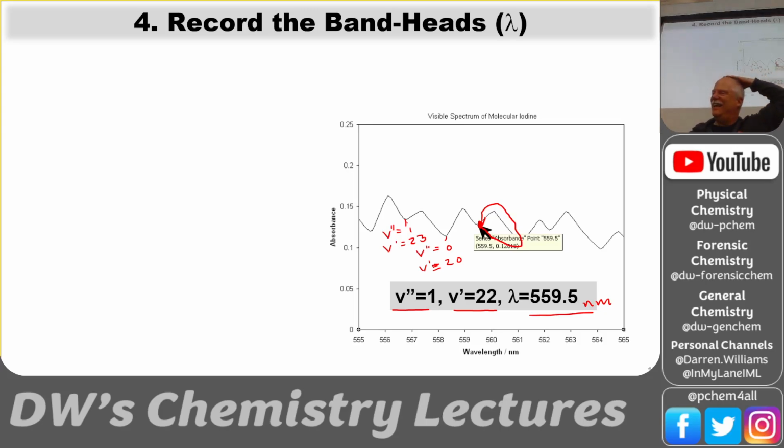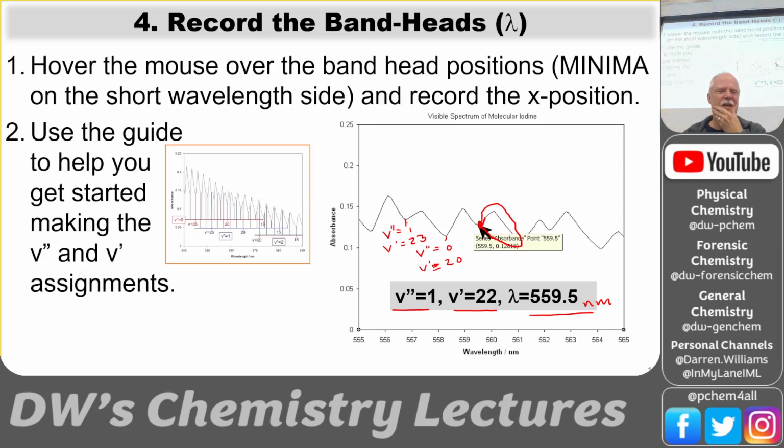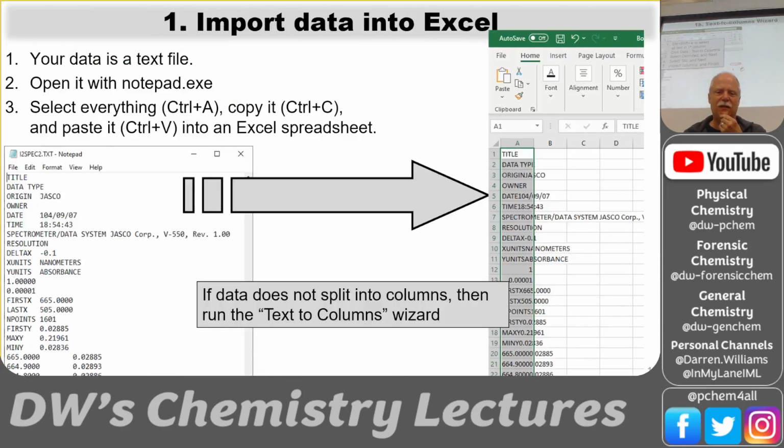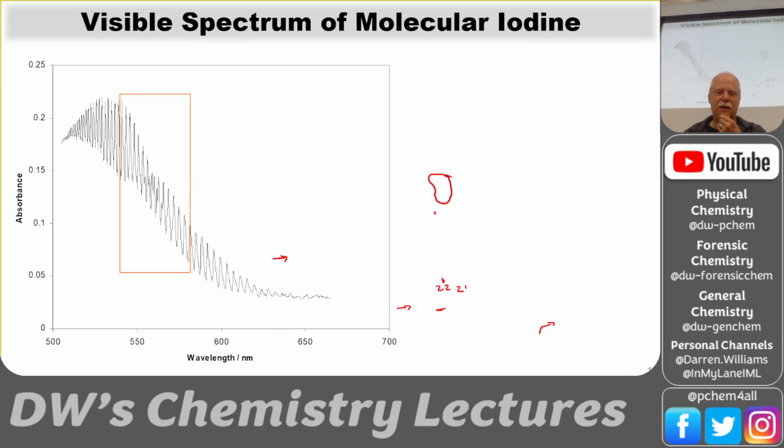Yay! So every once in a while, I hear some people grumble about peak picking. They're like, "Oh my gosh, peak picking!" Yeah, but it's what spectroscopists do. Okay, so hover the mouse, and that's essentially what I told you. Use that guide to start making your assignments. Okay, it does get a little bit difficult. Let me go back and look at the 3 series.